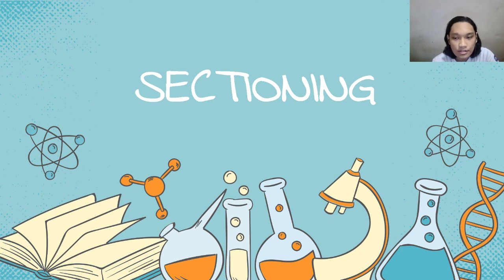Hello everyone, and in today's lecture we are going to talk about sectioning, and I will be discussing what is sectioning and the 5 kinds of microtome.